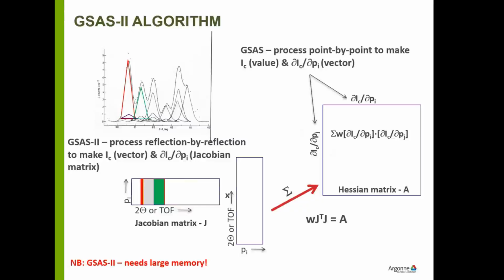If you calculate across the whole reflection profile, you dump the whole thing into the least squares matrix. Because we can calculate for each peak the partial derivative of each point in that pattern with respect to each parameter multiplied by the other one. And there you get the covariance, the least squares matrix, the so-called Hessian. So you just process your way across.